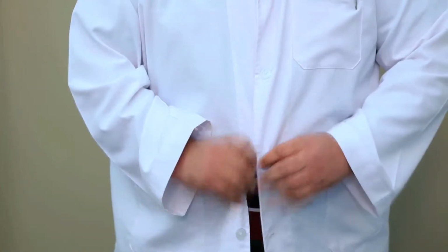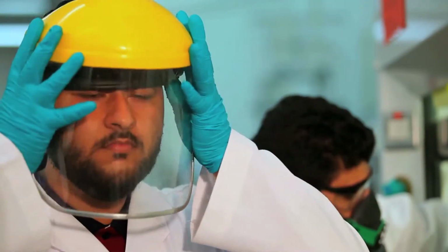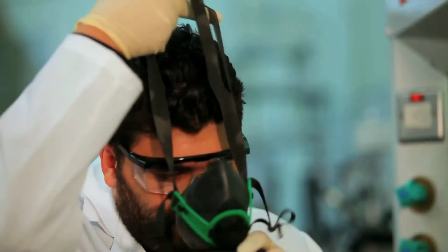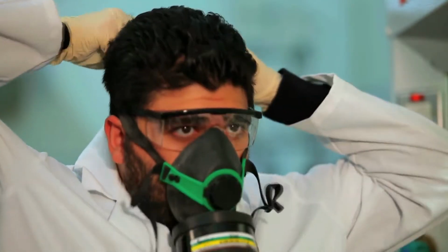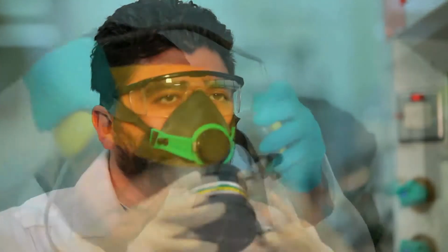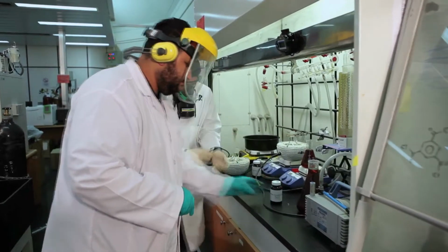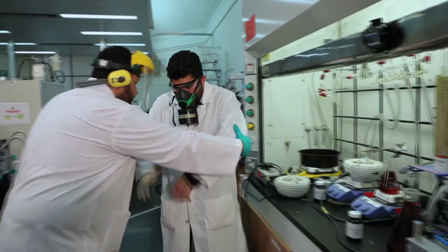A properly fitting lab coat, face and/or eye protection, gloves of the correct size and type for the hazard involved. Other lab or hazard-specific PPE items may be necessary, such as respiratory or hearing protection. In the event of an accident, you may be disoriented and need assistance. Your partner can provide vital, potentially life-saving help.